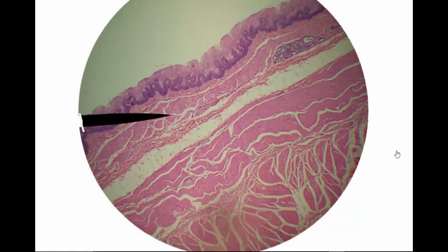Hello and welcome to Anatomy & Physiology at Glen Oaks Community College. I'm Dr. Ren Hartung. For this video we're going to talk about, I'm going to show you what I have my students know of digestive histology. So just a few slides of histology from different digestive organs.